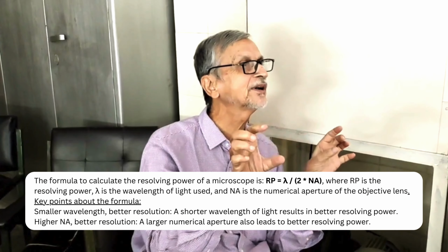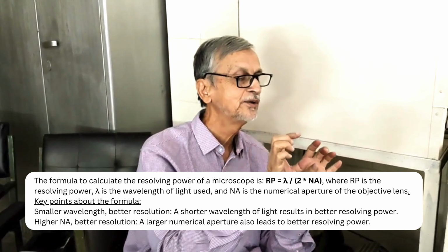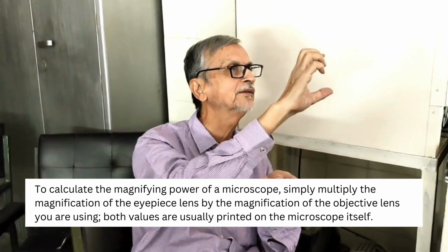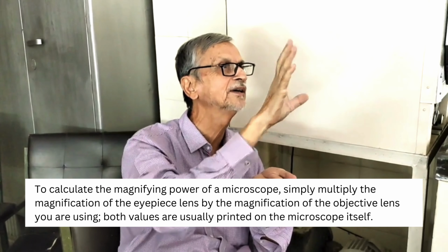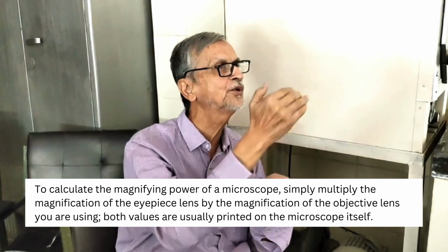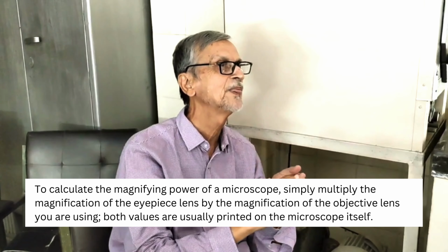There is a formula to calculate the resolving power, but I will not go into detail. Dr. Azmi has already told you how to calculate the magnification. The eyepiece is 10 times magnifying, the objective 10 times, you just multiply them. Total magnification will be 100 times, but without making any detail visible as far as the structure.